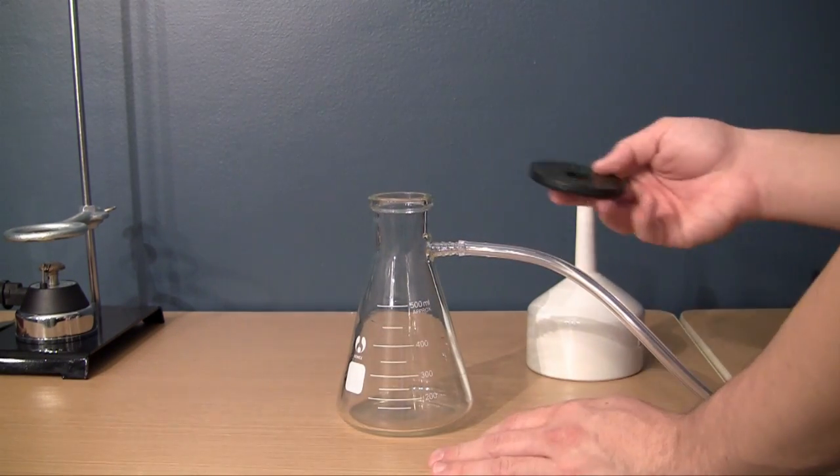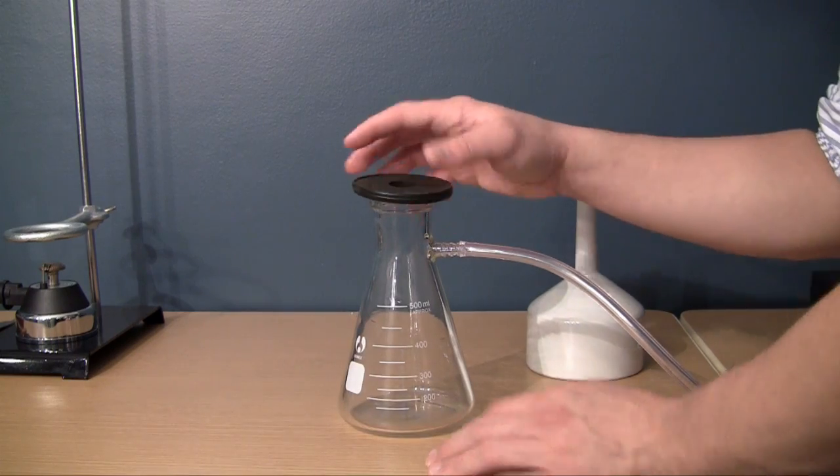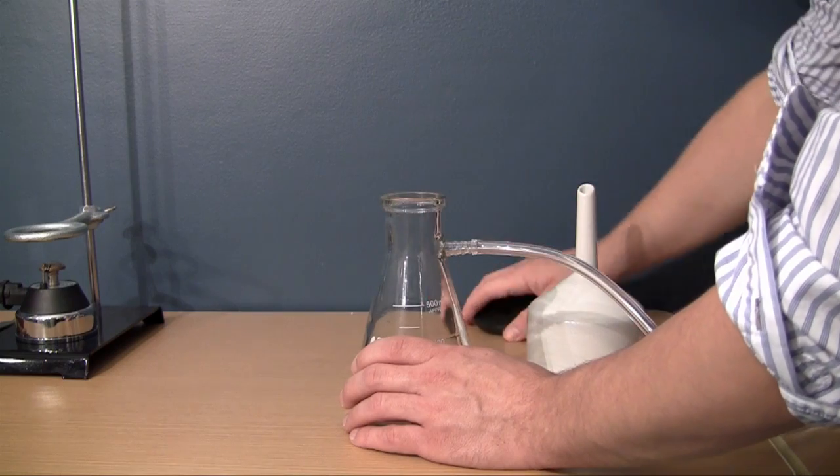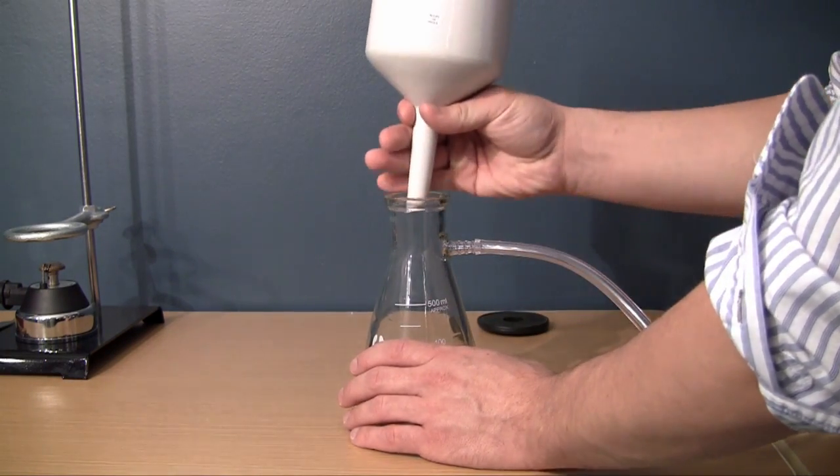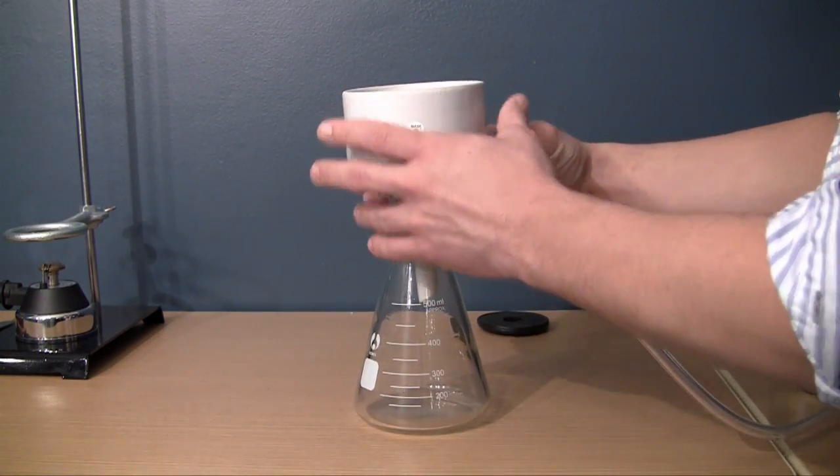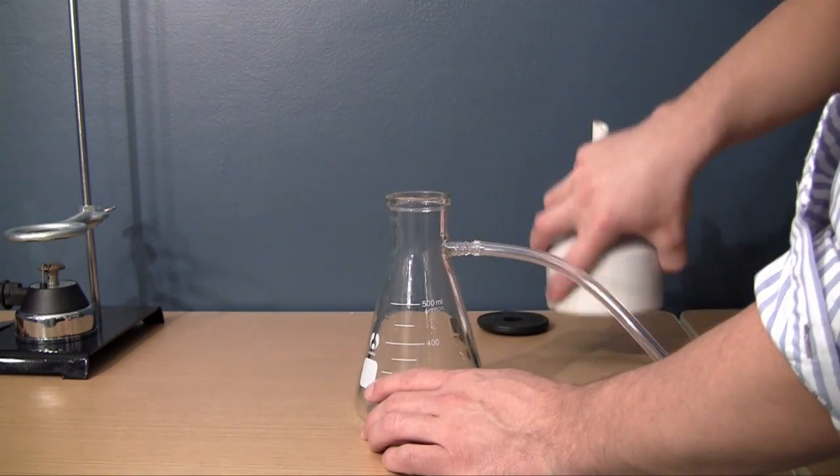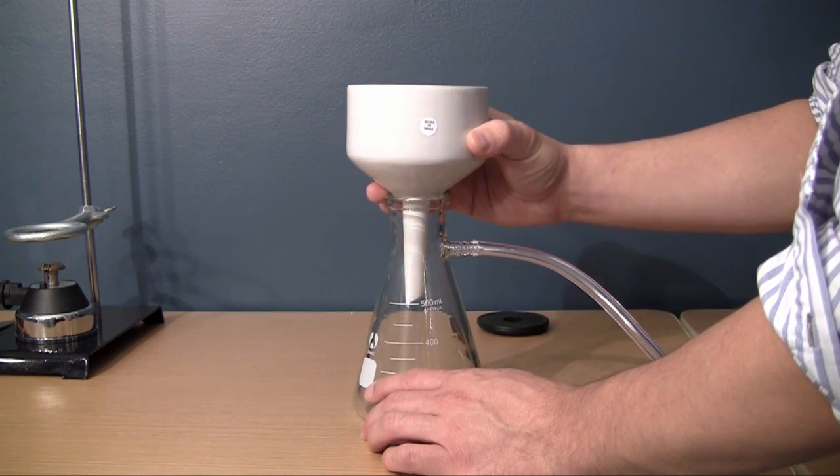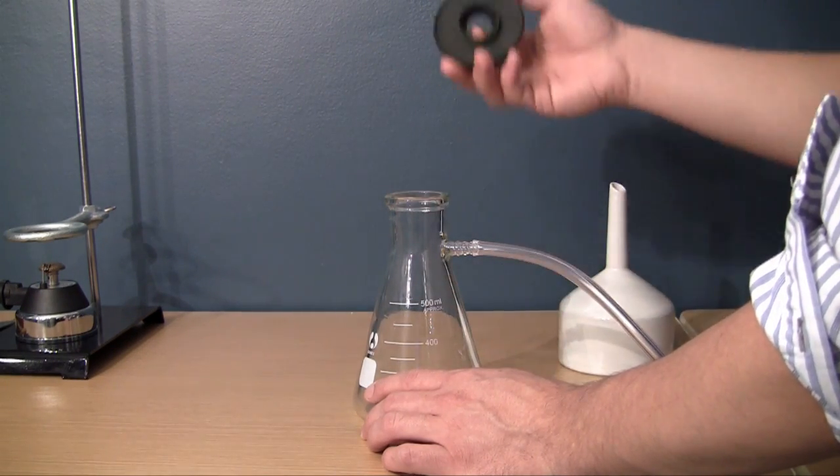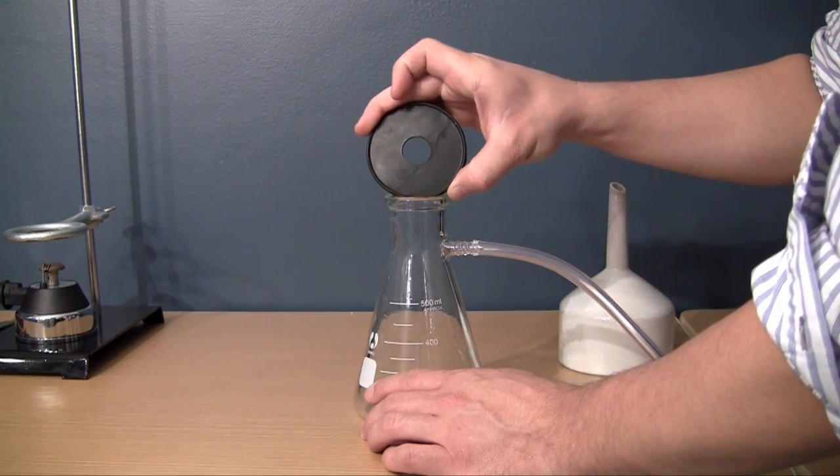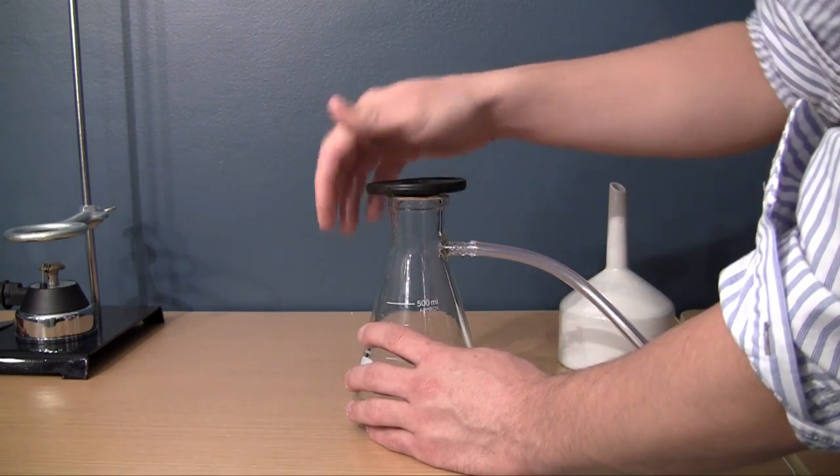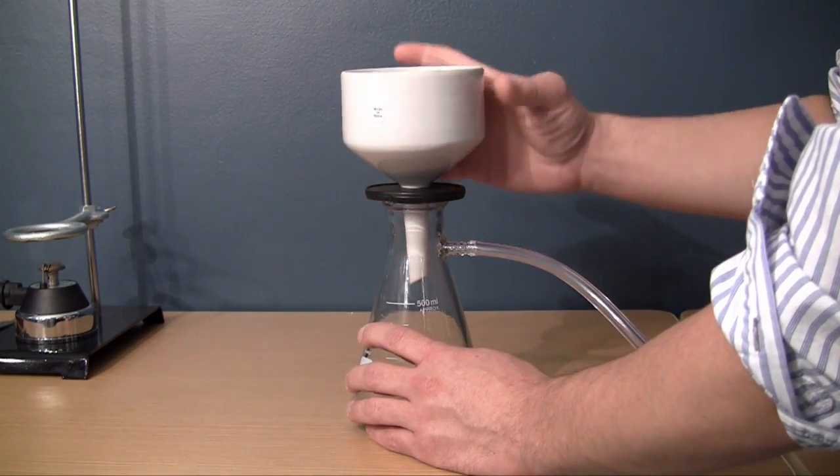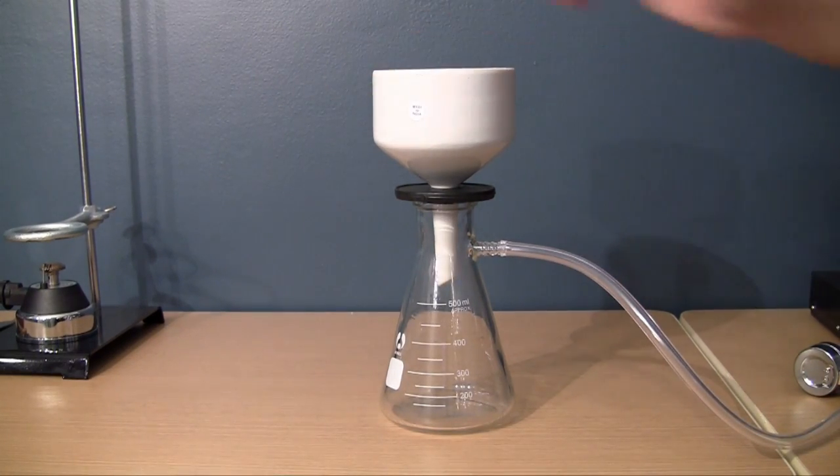So after that, go ahead and take your rubber stopper and put it right on your filtering flask like that. Now you put this on because what we're essentially going to do is we're going to add the funnel on top. So it makes the solution easier to go in the flask. However, if you just have it like this, it's going to be really loose. And we don't like loose things, of course. So what we need to do is we need to use a special stopper that pretty much came with the kit. So go ahead and put that on. And then go ahead and put your funnel on just like that. And look at that, nice and tight, beautiful.